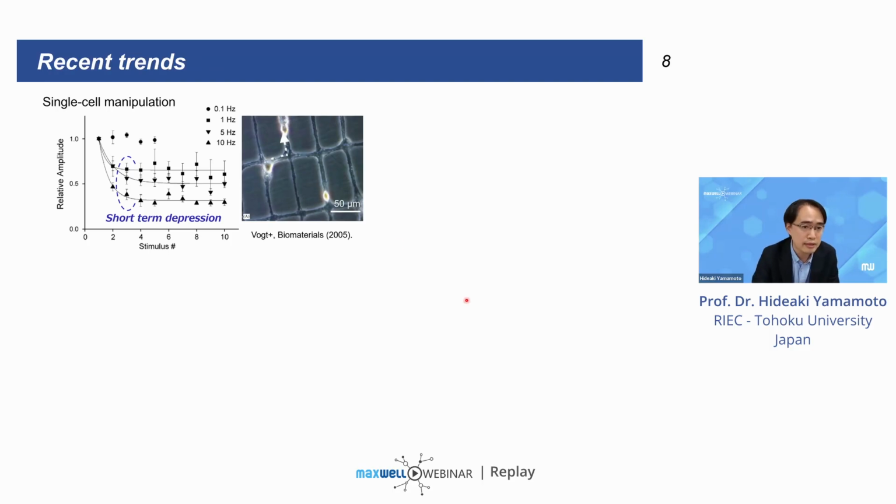And this technology has then matured over time. For instance, this is a micrograph from a paper by Professor Offenhäusser's group in Jülich in 2005. Here you can see that neurons are aligned against discrete micropatterns at a single cell resolution.